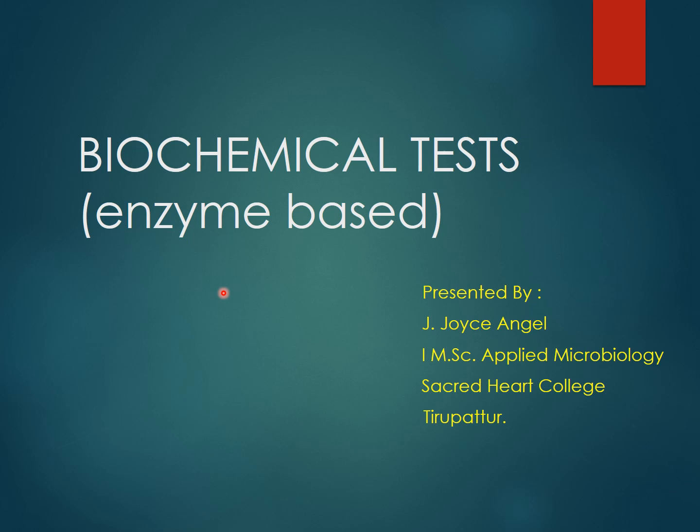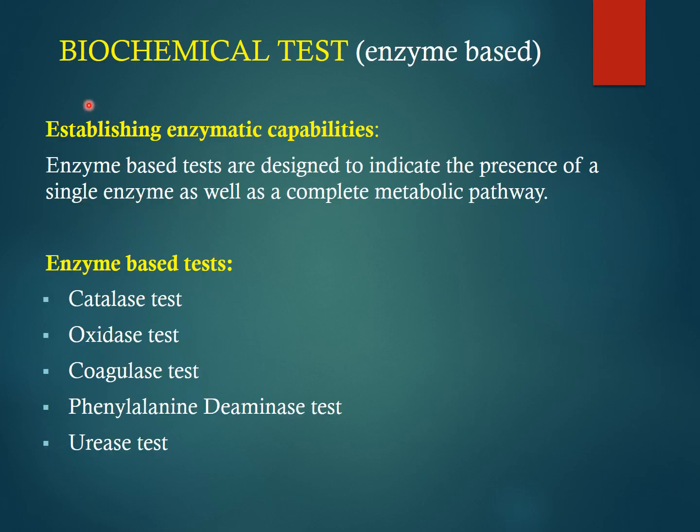In this video, we are going to study about biochemical tests. These biochemical tests are classified into enzyme-based biochemical test, carbohydrate-based test, protein-based test, and others. Now we are going to study about enzyme-based biochemical test, establishing enzymatic capabilities.